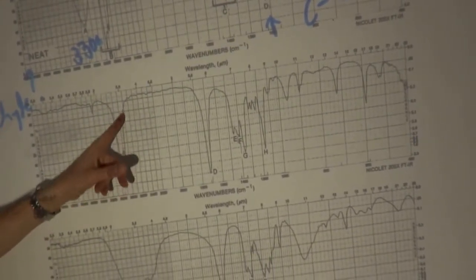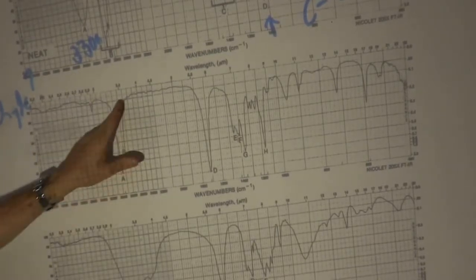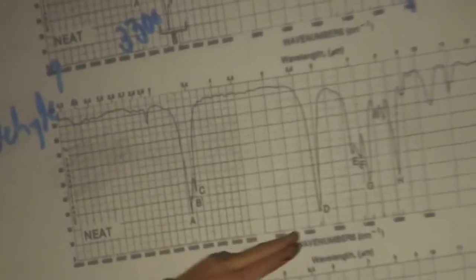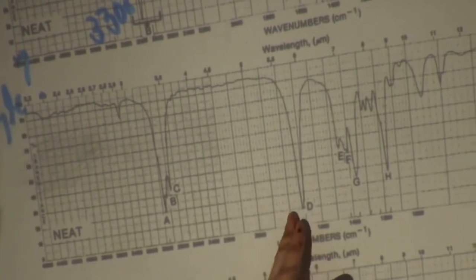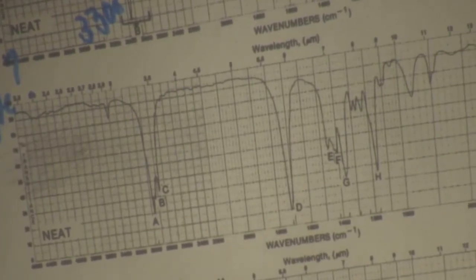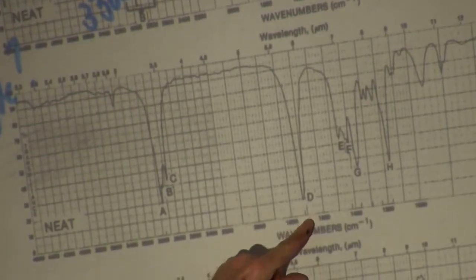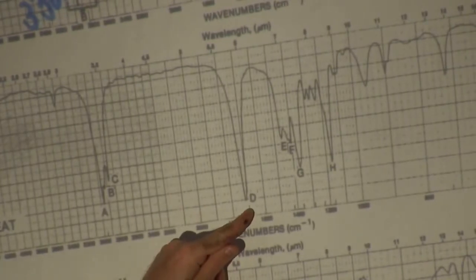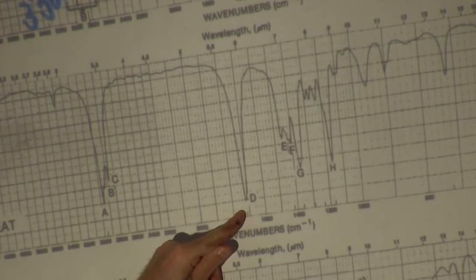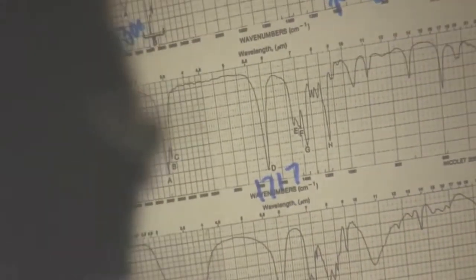If I'm looking here, I really don't see much of anything over here, so I'm suspicious of an aldehyde. Our peak here, and you should get good at reading analog. I know everyone is into the digital mindset, but learn to take a scale and go, okay, 1700, 1800, these tick marks are 20. So I go 10, 20, 40, 60, 80. That's right at about 1715, if the number digitally was 1717.